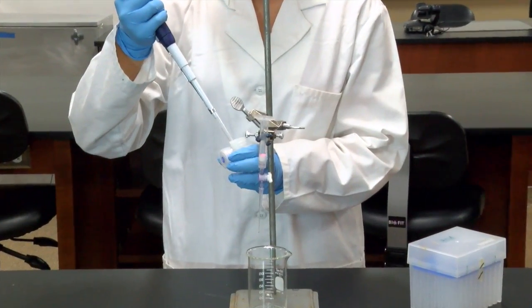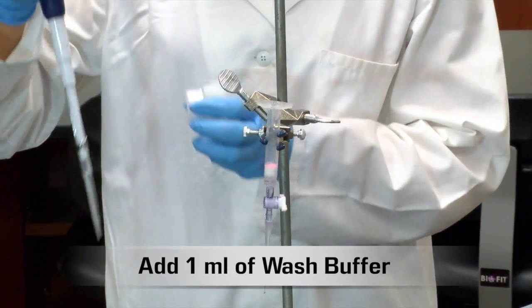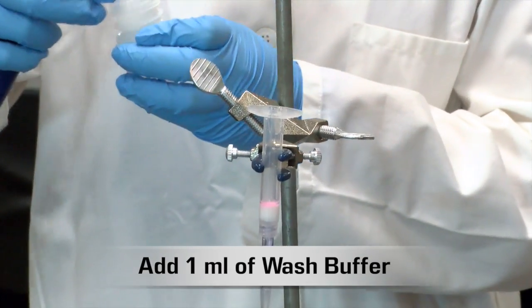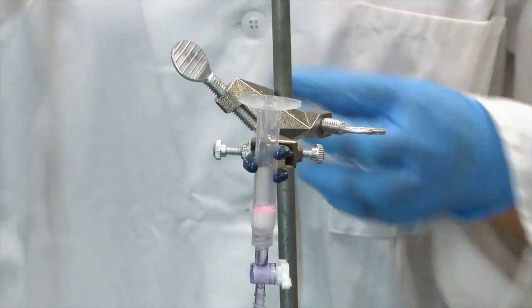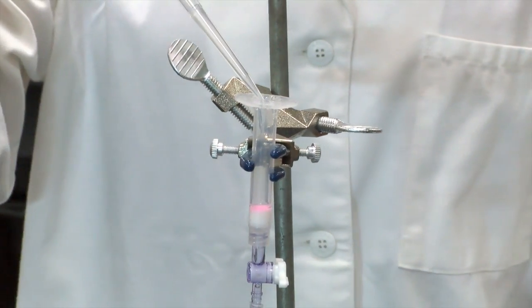The next step is to add 1 mL of wash buffer, which is a moderate salt concentration. Proteins that are moderately hydrophobic will be released from the beads and flow through the column.